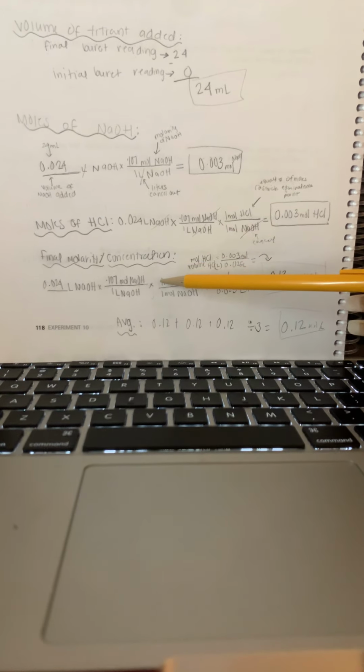Now we're going to do the calculation of the final molarity, the concentration of the hydrochloric acid. So now I set up the whole equation for you again, so I'm just going to read it through. It's 0.024, which is from the 24 milliliters converted of sodium hydroxide, and the 0.107 moles of sodium hydroxide divided by the 1 liter, and then times the 1 to 1 mole ratio of hydrochloric acid over the sodium hydroxide, and multiply by 1 over 0.025 liters of hydrochloric acid.